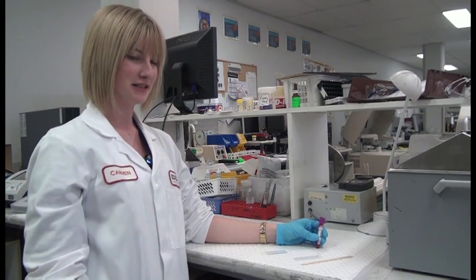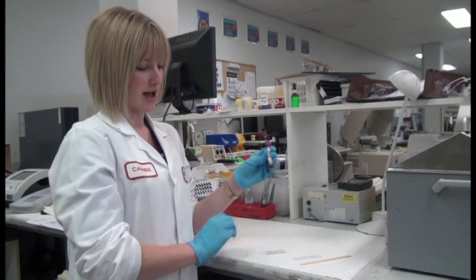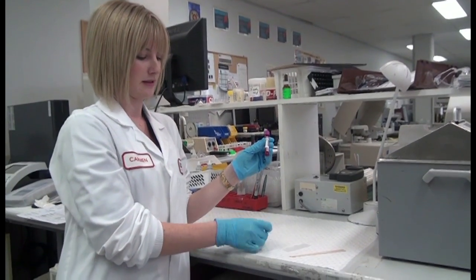Today I'm going to show you the basic process of making a blood film in the laboratory. I've got my EDTA tube, two wooden applicator sticks, a spreader, and the blood slide.